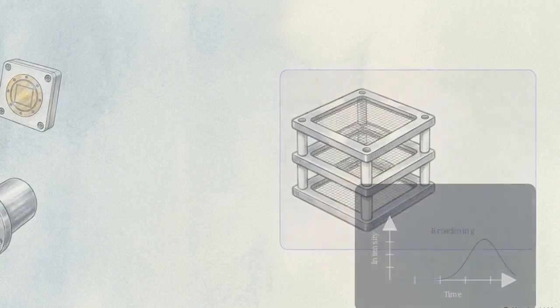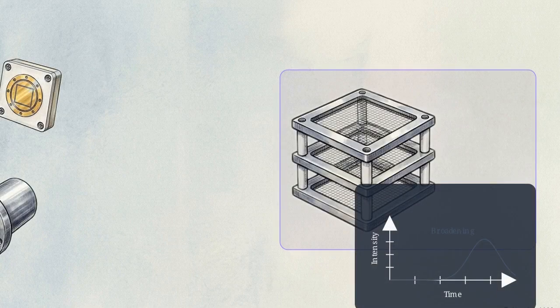The physical solution to peak broadening is the reflectron, replacing the flat detector with an electrostatic mirror. This field acts as a highly tuned braking system. When identical masses with different kinetic energies enter the field, the faster ion penetrates deeply into the mirror before its path is reversed. Because the faster ion takes a physically longer path through the reflectron, the slower ion has time to catch up by taking a much shallower path. This perfectly aligns their exit trajectories, ensuring ions of the same mass hit the secondary detector at the exact same microsecond. Ultra-high resolution is restored.